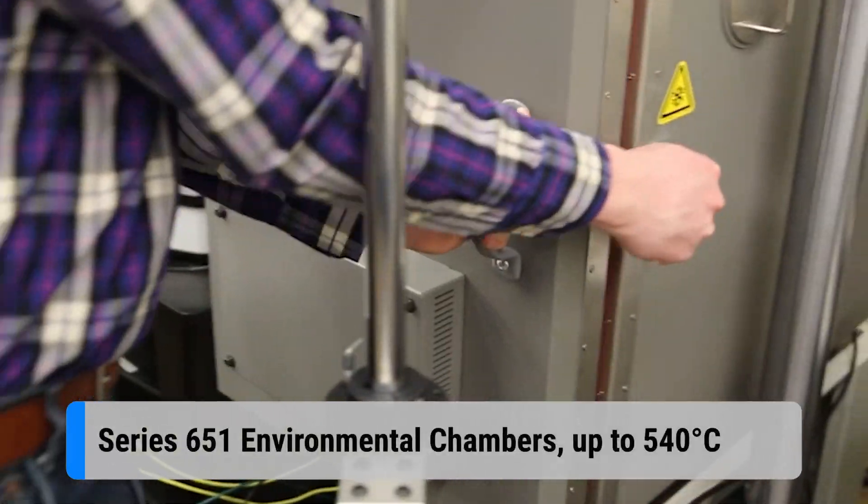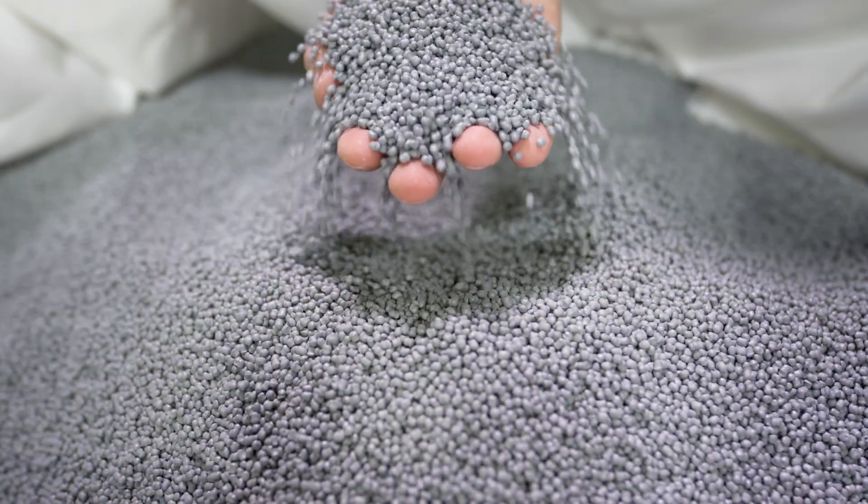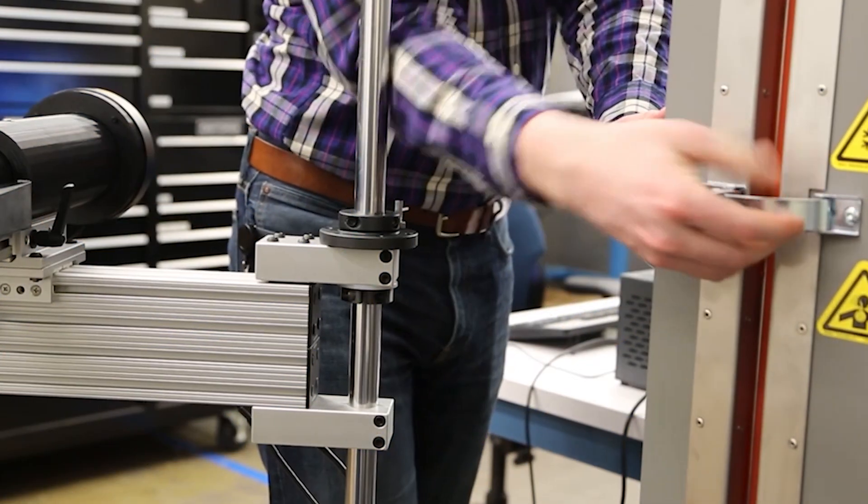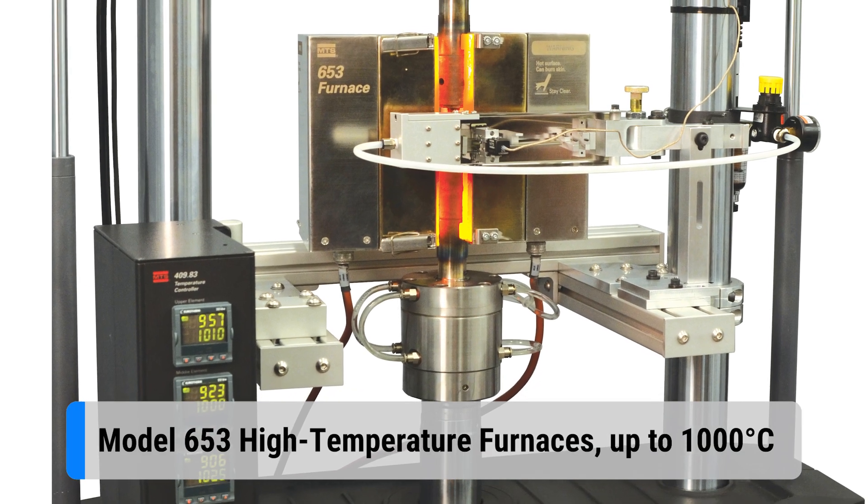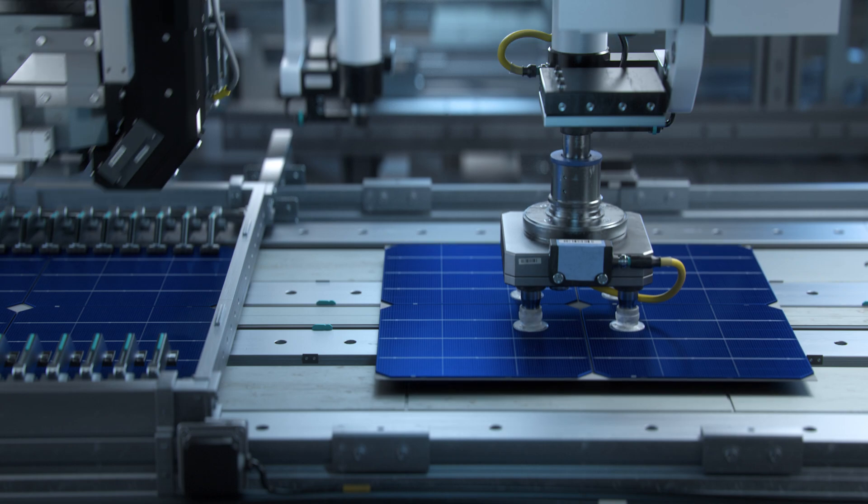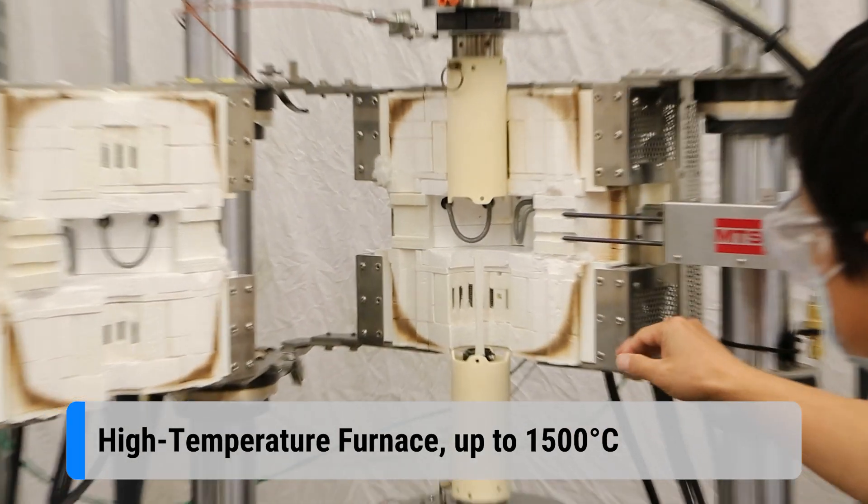Environmental chambers are typically used to test polymers, plastics, and polymer matrix composites for temperatures up to 540 degrees Celsius. Furnaces support isothermal high-temperature testing of metallic and ceramic materials up to 1500 degrees Celsius.